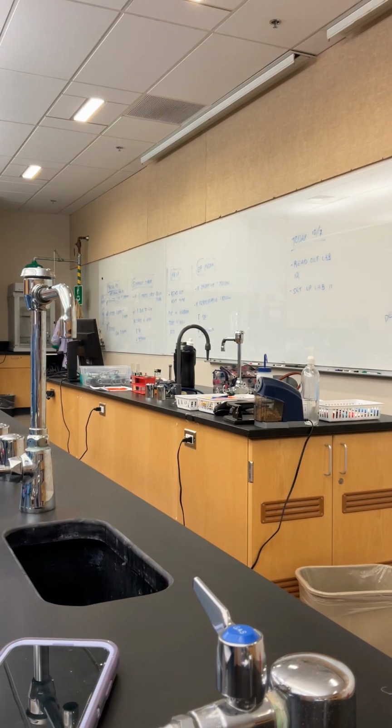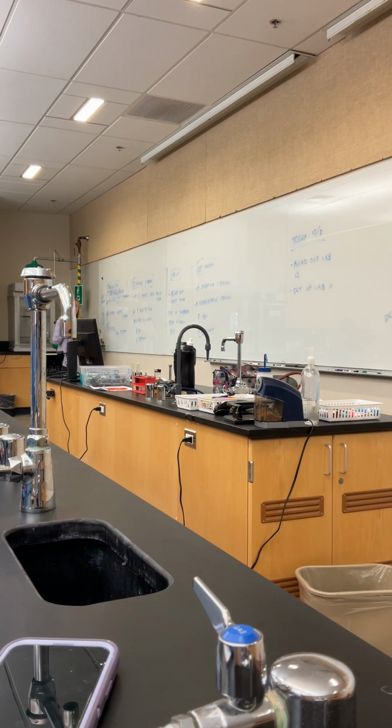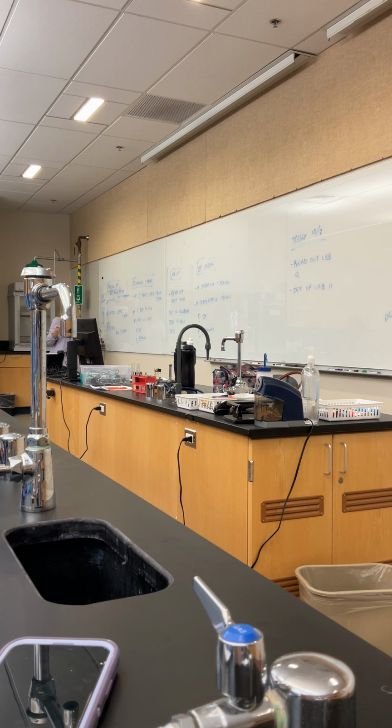The ED pathway. Good. So in the ED pathway, I'm making some pyruvic acid, but I'm not making a lot of energy. So if I'm only giving him glucose in this broth, there's not a lot of nutrients there, and he's not going to be able to survive for very long. He needs additional nutrients to support his lame pathway, even though he's insistent on using that flip phone. We just wish he would update, but he won't. So he can eat glucose a little, but not enough to change the acid content, so not enough for us to see a color change.